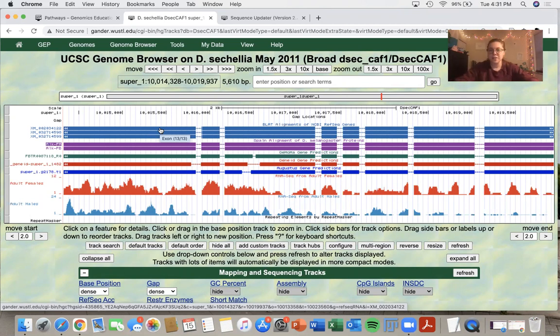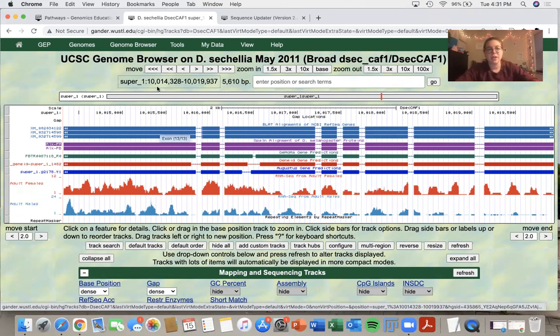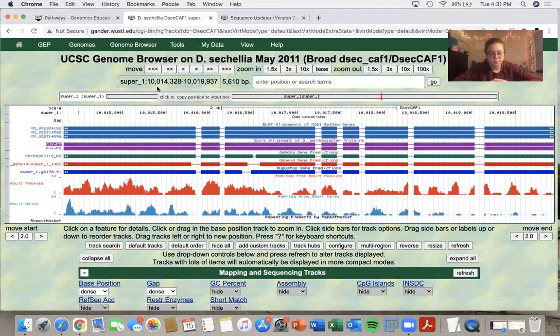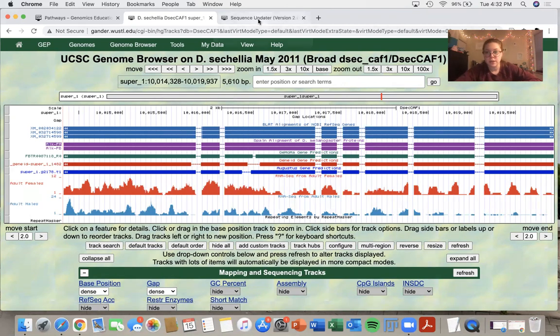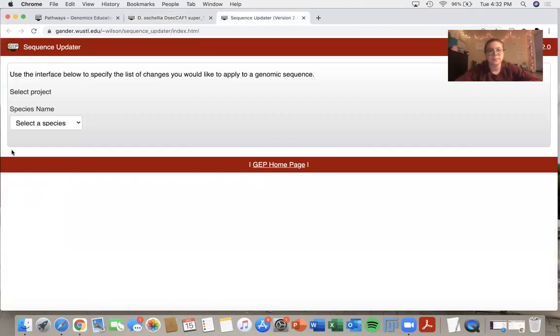So back to this annotation. As I said, I'm going to be using the ALK gene in Drosophila sechellia, so I navigated there. And now I will show you what the sequence updater looks like.